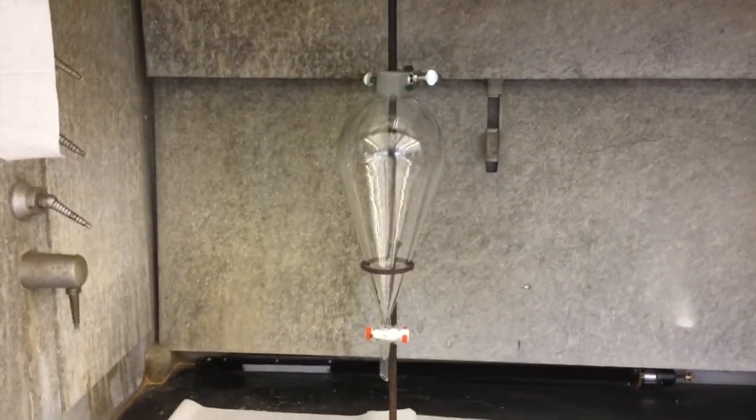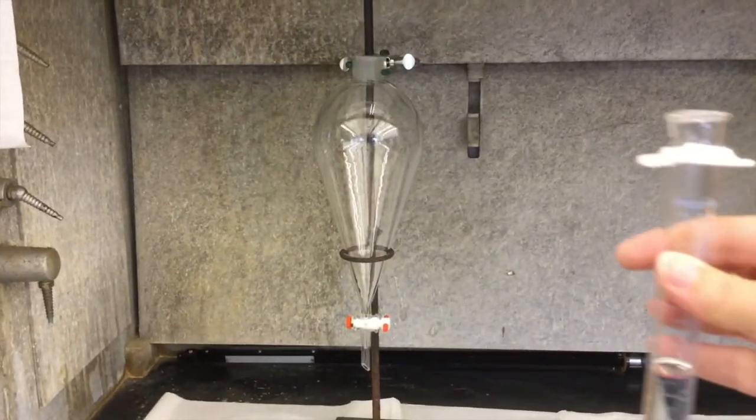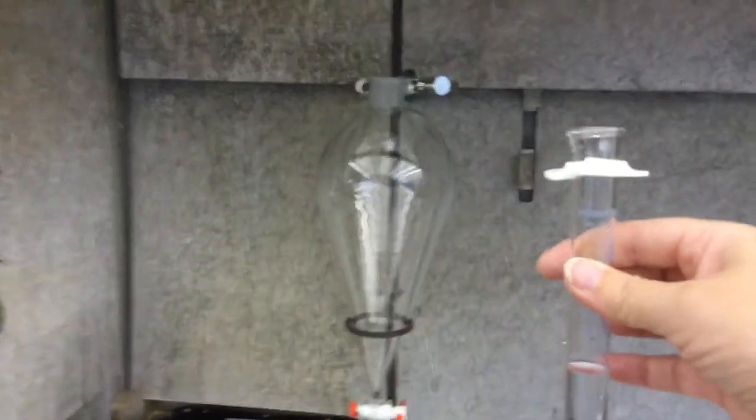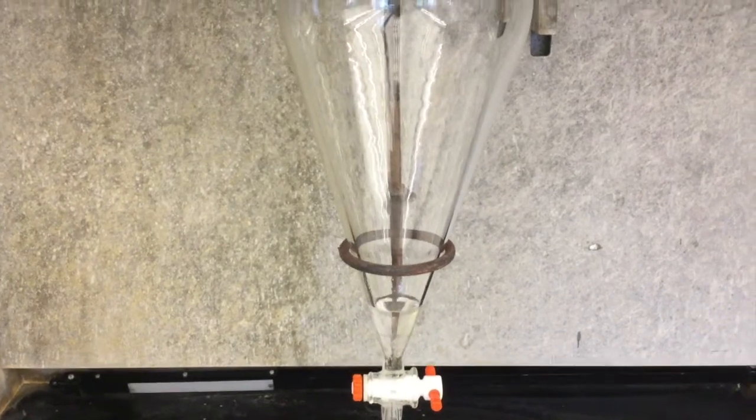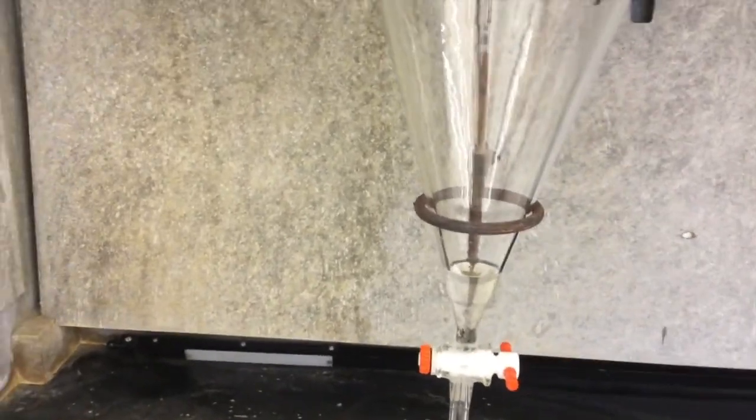Once you have made your measurements, take your graduated cylinder into the hood and pour the ice and the hexanes into the separatory funnel. The layer that is aqueous with water will separate out from the hexanes and will be able to separate the two in mass.